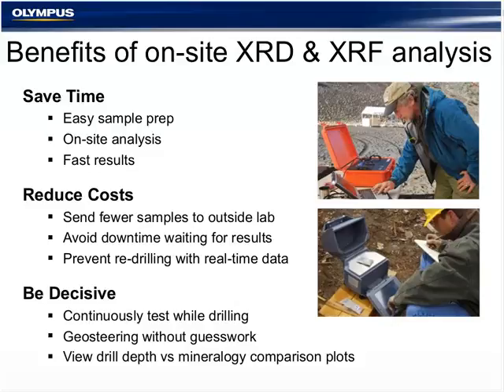Dawn will be talking more specifically about how the mud logger uses these technologies. But first, I want to start with a basic introduction to XRD and XRF technology, and how they are similar and how they differ.